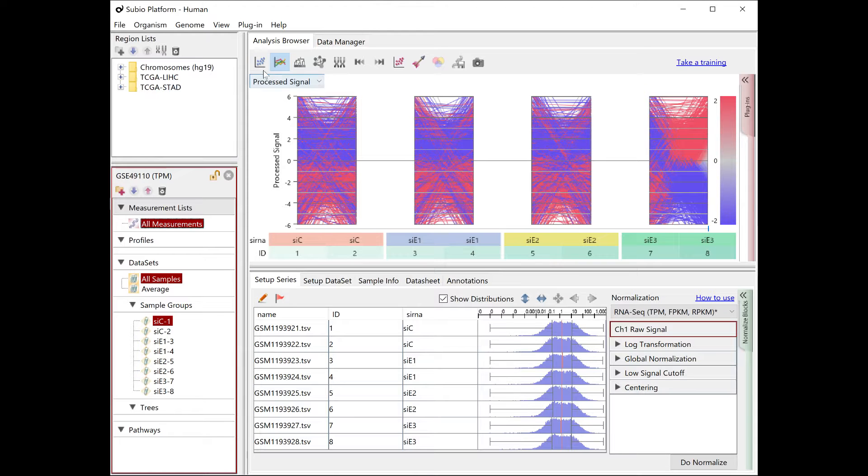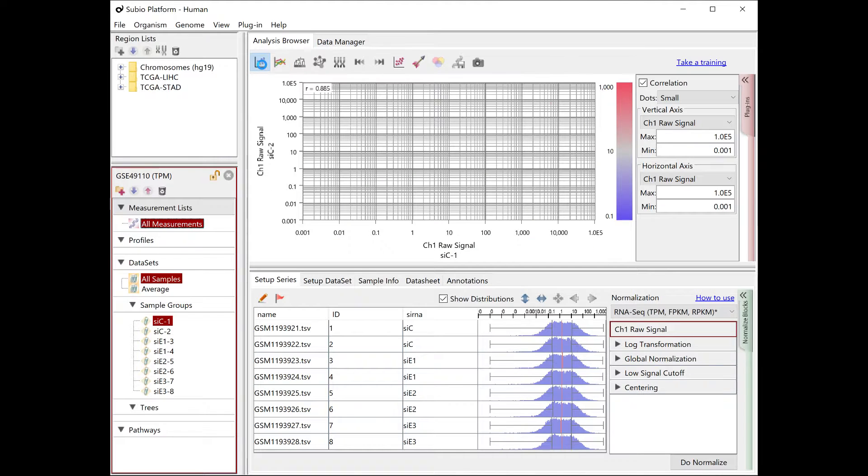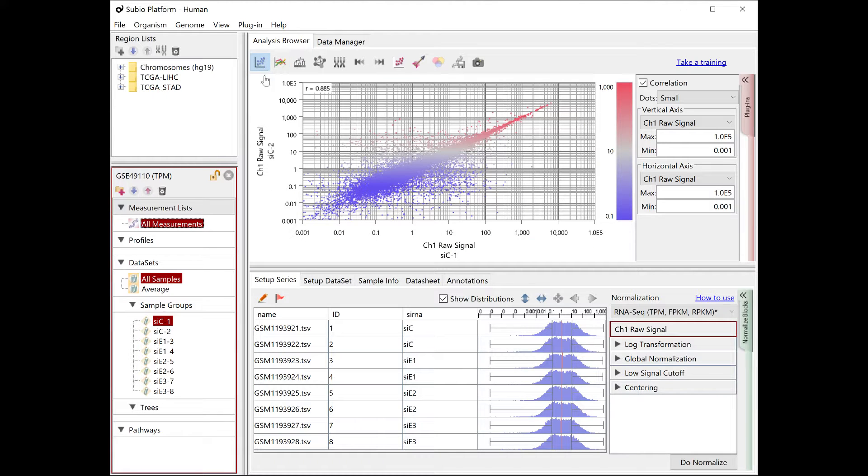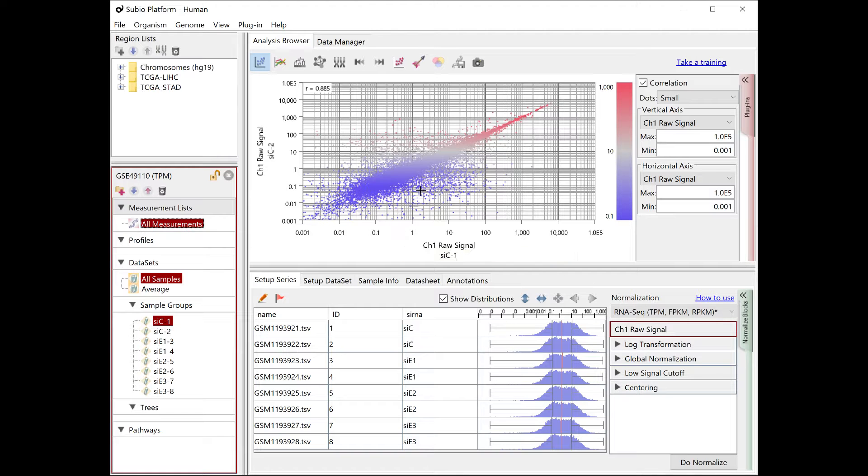If you look at the TPM, FPKM, RPKM data in a scatter plot, you can't tell where the noise range is.